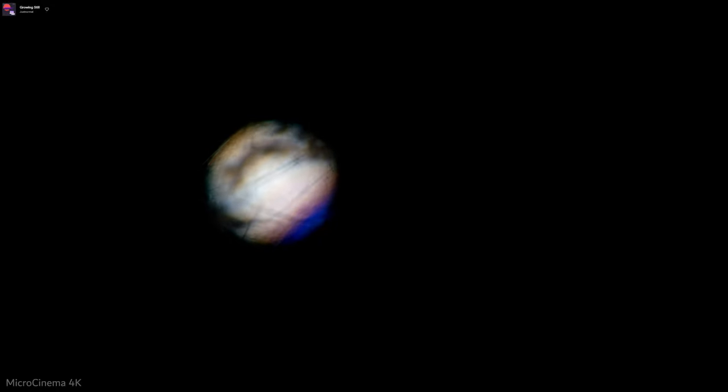And once we've got that set up, I'll be able to have like a dynamic scale bar. And that's gonna allow me to do just some like super duper neat stuff. And at least for you guys, you'll never have to ask me what magnification I'm at, because it will be abundantly clear. That's at least in theory. So yeah, more to come on that.